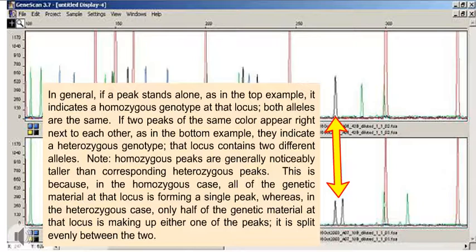Note, homozygous peaks are generally noticeably taller than corresponding heterozygous peaks. This is because, in the homozygous case, all of the genetic material at that locus is forming a single peak, whereas in the heterozygous case, only half of the genetic material at that locus is making up either one of the peaks. It is split evenly between the two.